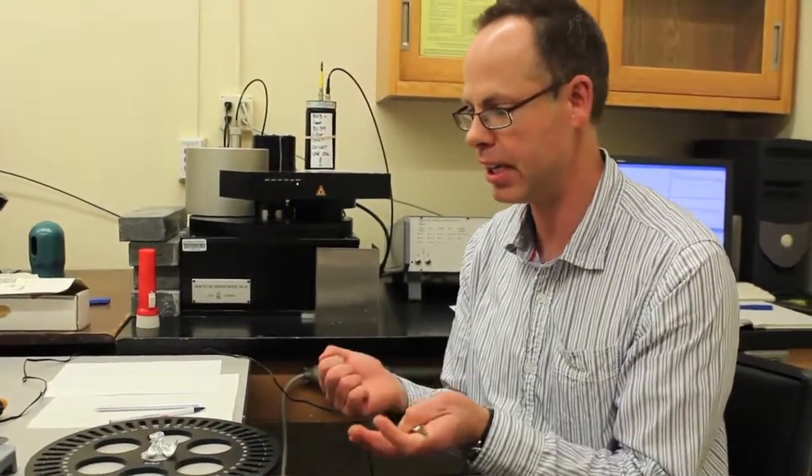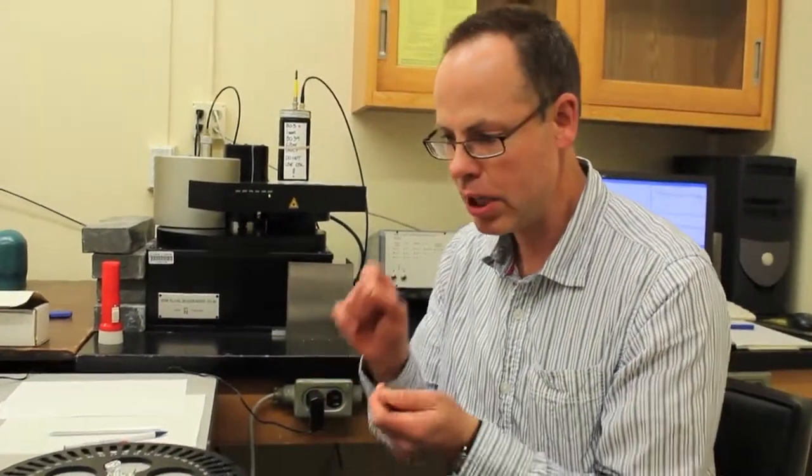We combine the different signals from different portions of the sample that we measure, and we look at this different response for different measurements made at different times through that. The main thing we're trying to do is find out basically how much radiation damage, it's a very soft form of radiation damage, just in the form of trapped electrons, how much of that occurred before we got hold of the sample by digging it out of the ground or pushing it into a steel tube in a pit, for example.